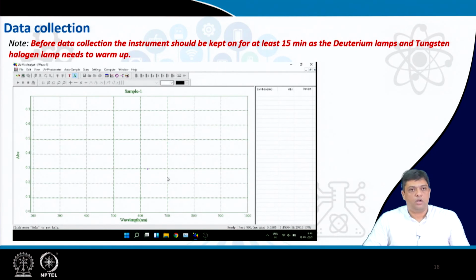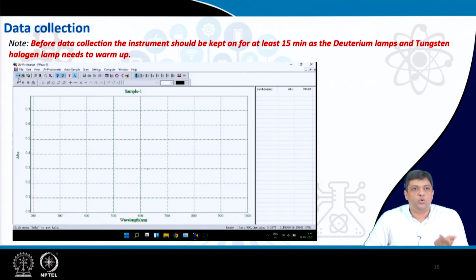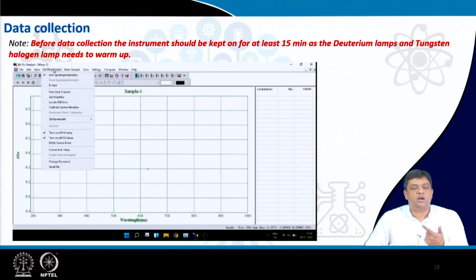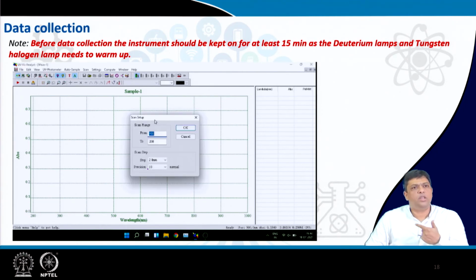initiating the whole experiment. So, then you set up the software, you will define all the conditions, and then you will tell, let us say, the number of cells, the solution which you will be using, the kind of solution you are using, and the various other parameters which you are knowing about the sample. You will give the sample name, the wavelength, all the details about the sample you will be defining.